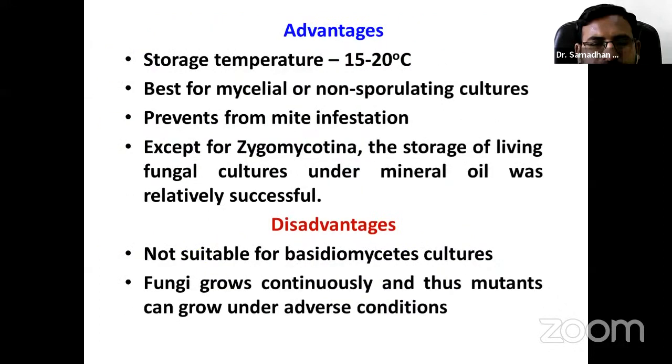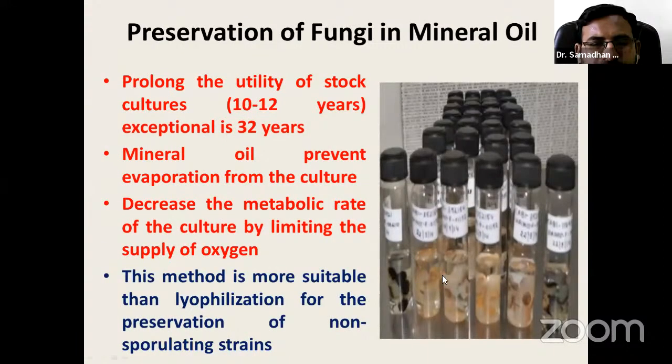There are also some factors responsible for mineral oil preservation. You should not take too much oil, as it can restrict the oxygen level, and it should not be too low, or it will dry out the culture. So it should be optimum.